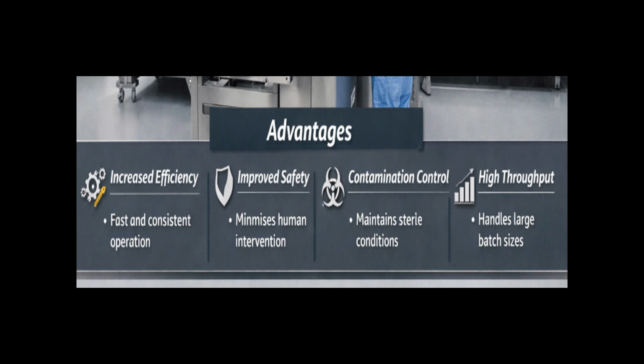Advantages of automatic loading and unloading system for lyophilizer. Increased efficiency, as the ALUS system allows fast and consistent operation. Improved safety, as it minimizes human intervention. Contamination control, as it helps to maintain sterile or aseptic conditions. And high throughput, as it can handle large batch sizes.